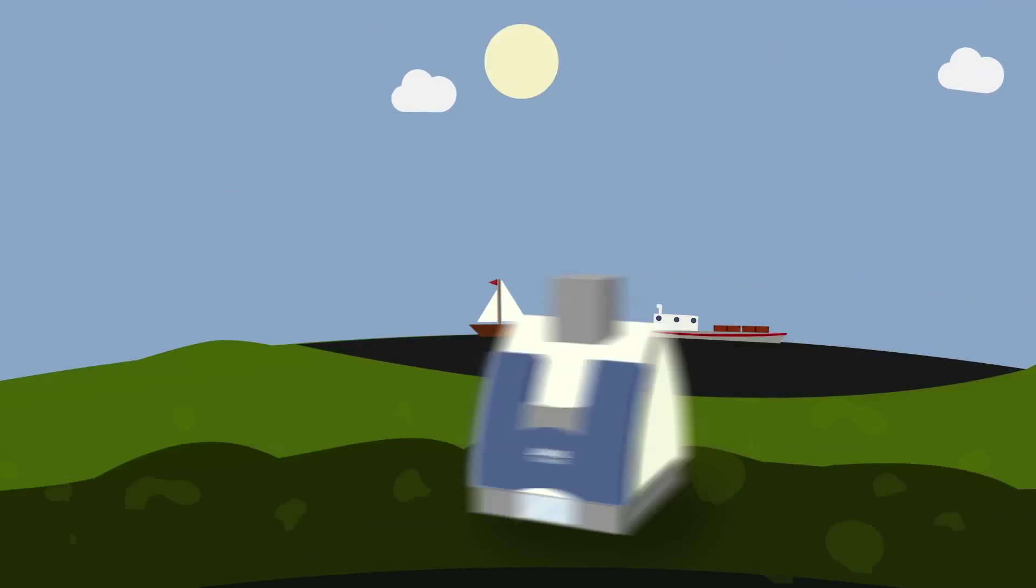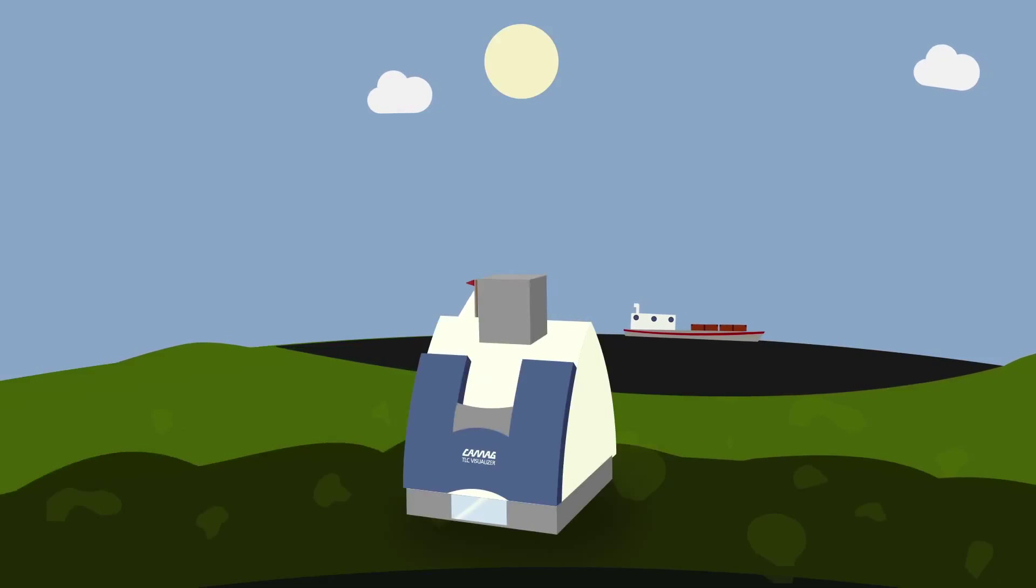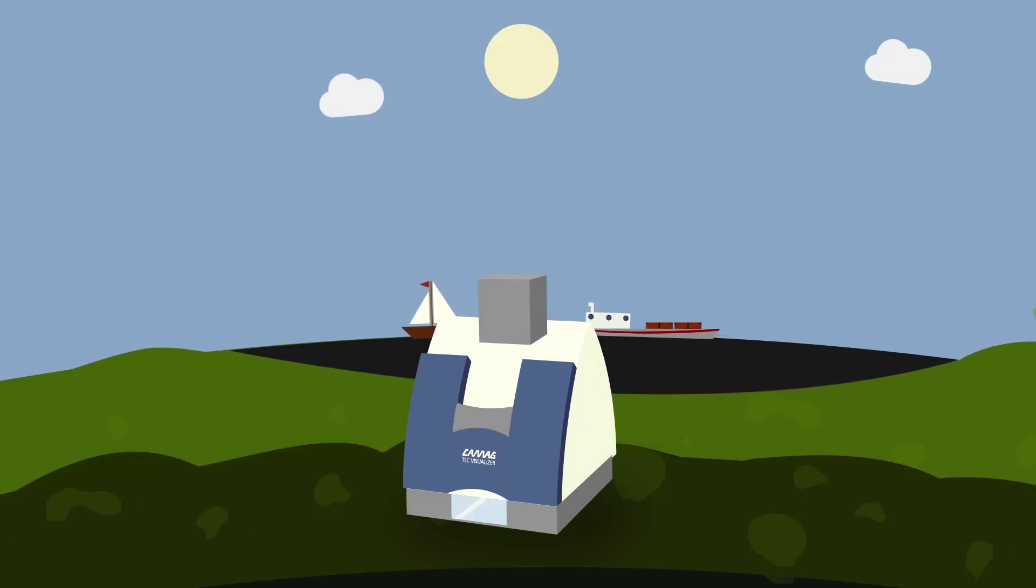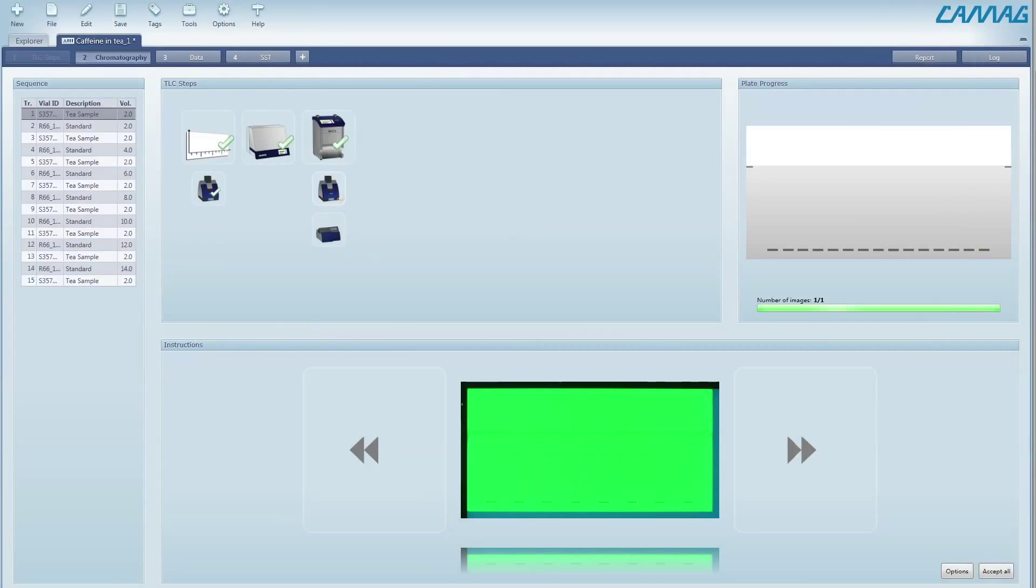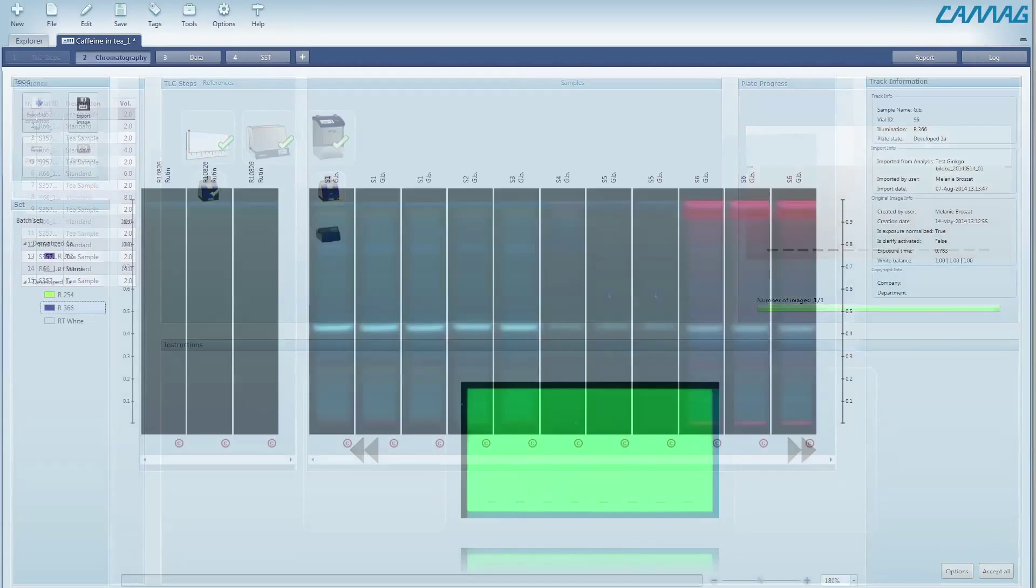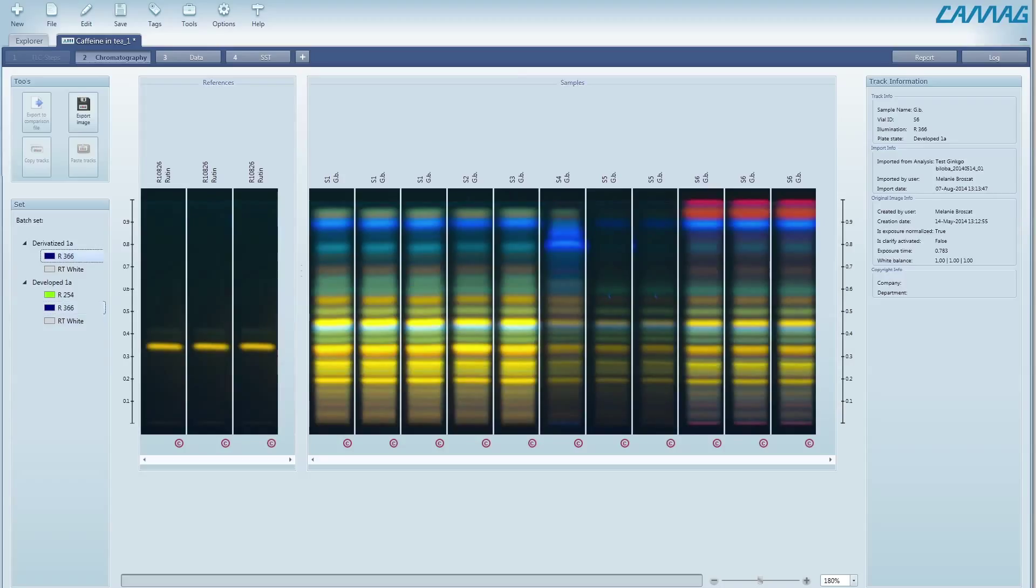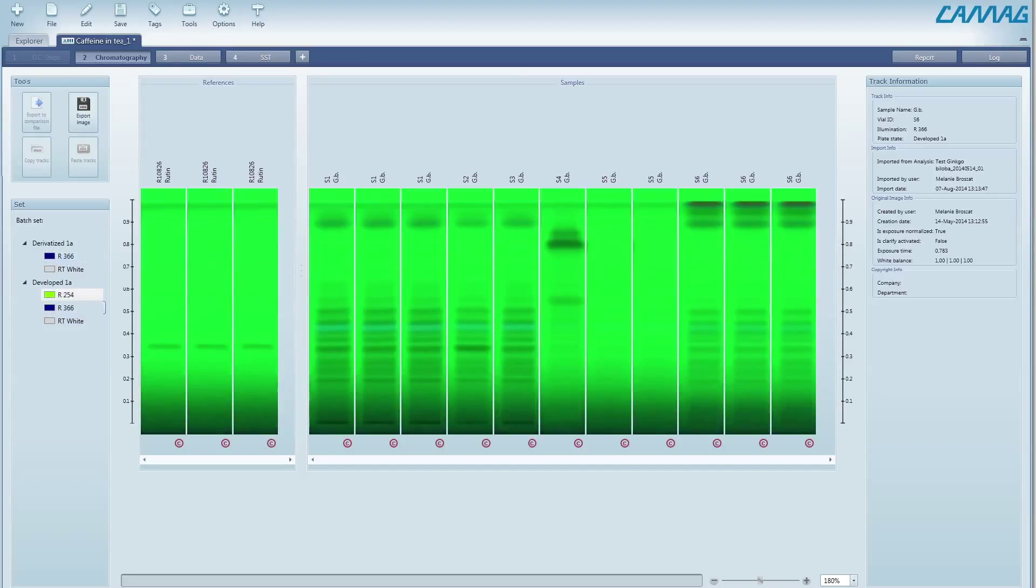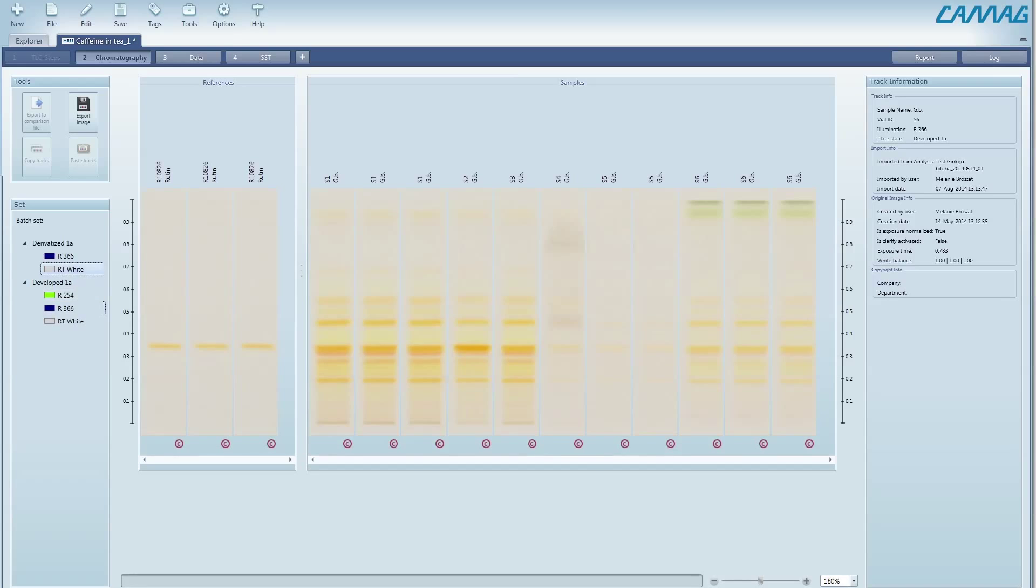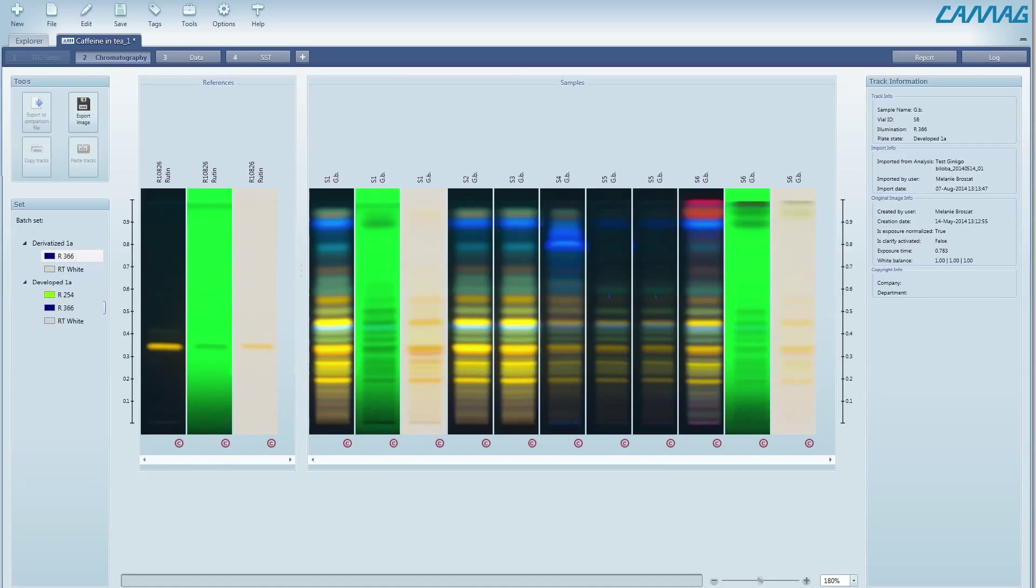Controlled by VisionCats, the TLC visualizer can generate low noise, high dynamic range images. With the image comparison viewer, tracks originating from the same or different plates and detection modes can be compared on the same screen, side-by-side, and as many as you need.